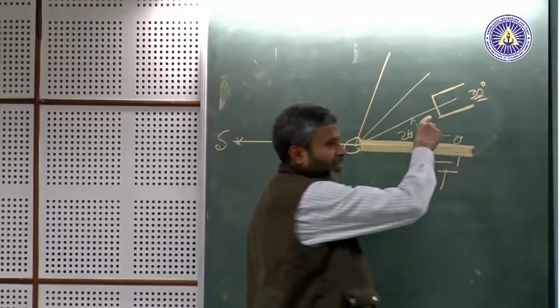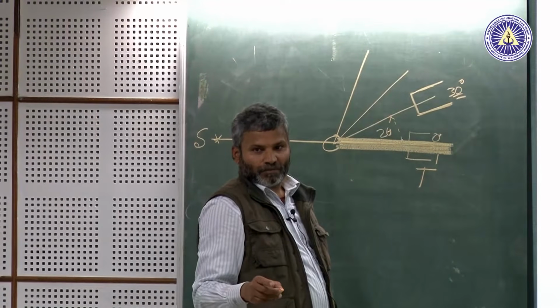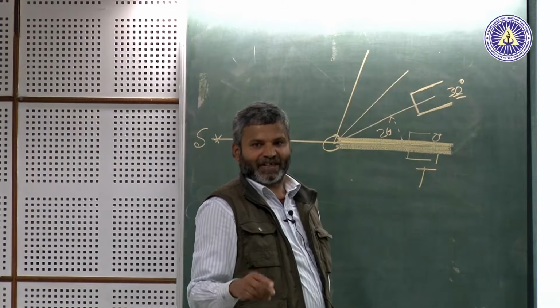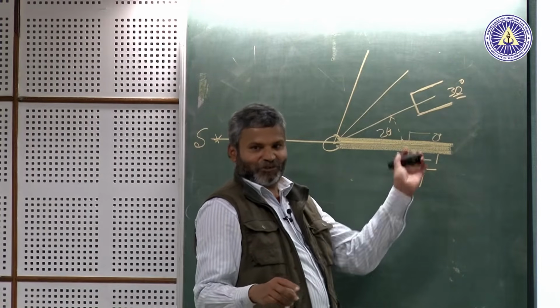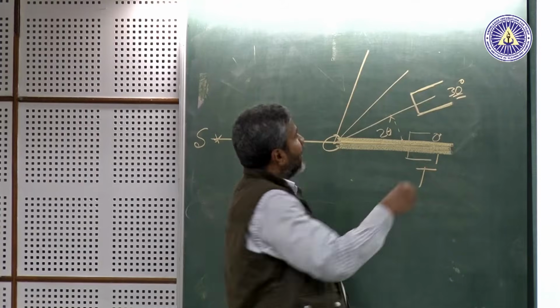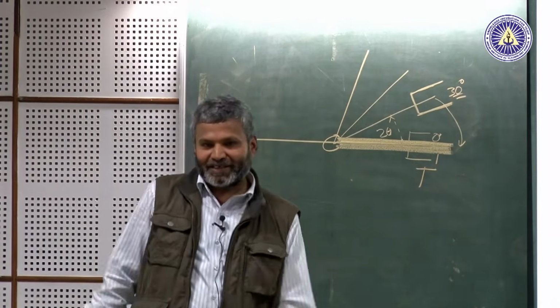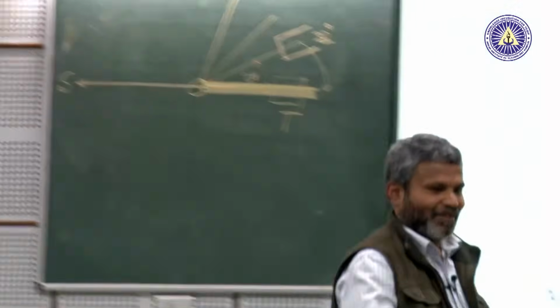In fact, most modern diffractometers will not allow, for safety reasons, to save your detector, to bring it to the transmitted beam. In the olden days, this safety was not there, and sometimes if a student actually brought it down to 0, the detector got destroyed. Okay.